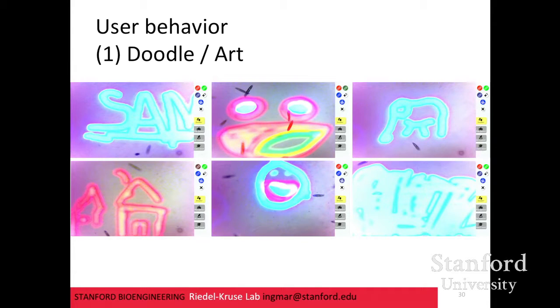The other aspect is usually one person is occupying the touchscreen, the other person has nothing to do, then starts looking through the eyepiece and suddenly realizes that what the other person is drawing is coming in the eyepiece, and then people start having conversations with each other.